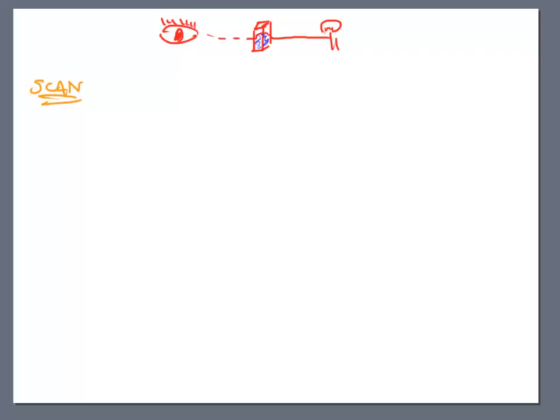It saves me a lot of headache. It saves me a lot of trouble. And that's the purpose of the scanning feature on the machine. Those old Spectronics that we have have a scanning feature on it. The newer instruments from Thermo, we have a scanning feature on that one as well. And the purpose of the scan, again, is to tell you what lambda you should be running at.